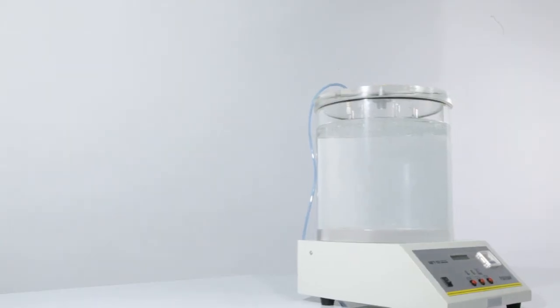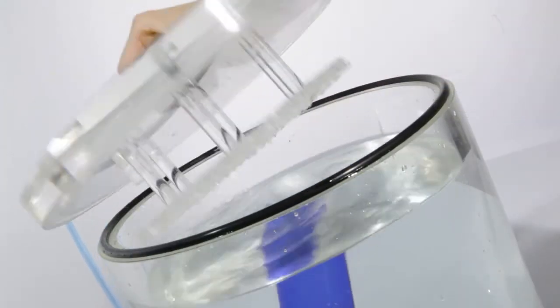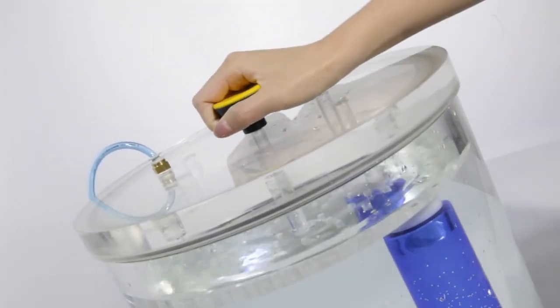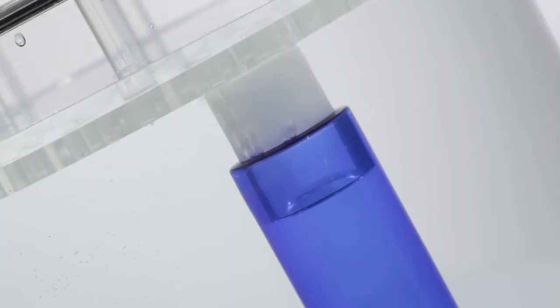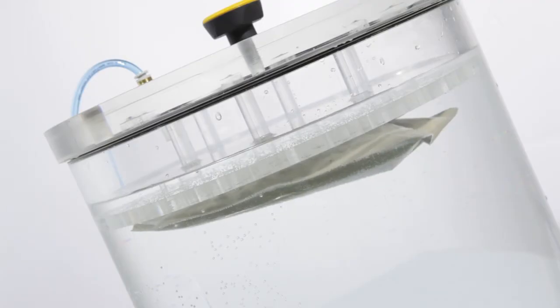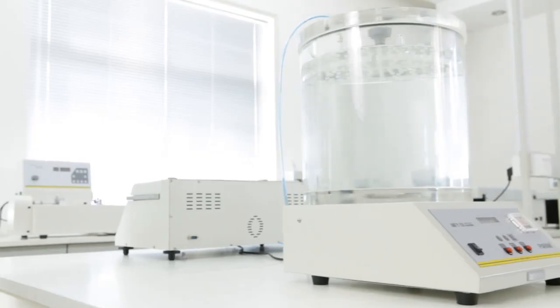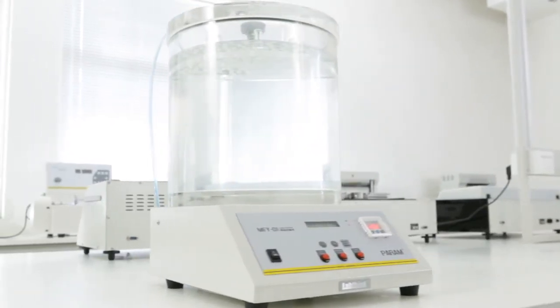MFY01 works by creating a vacuum in the test chamber to create a pressure difference between the inside and the outside of the specimen. By observing the leakage behavior of the specimen and how the specimen expands and restores to its original shape after vacuum release, users can quickly determine the sealing properties of the specimen.